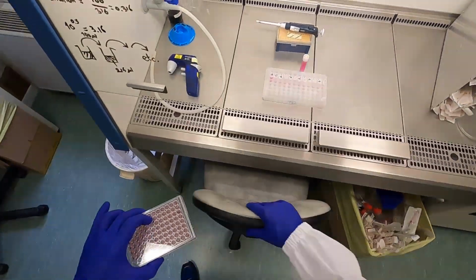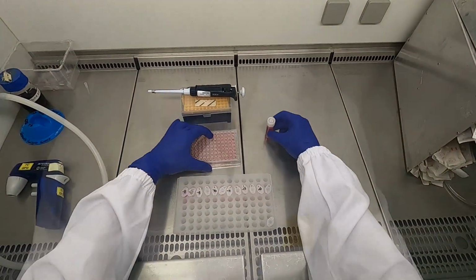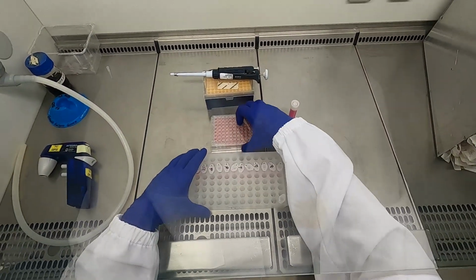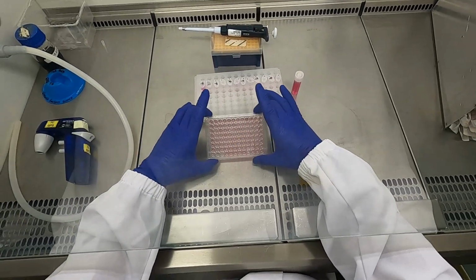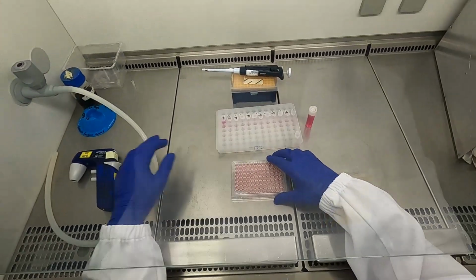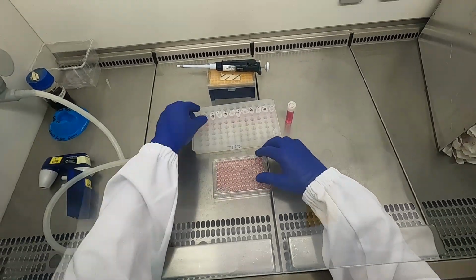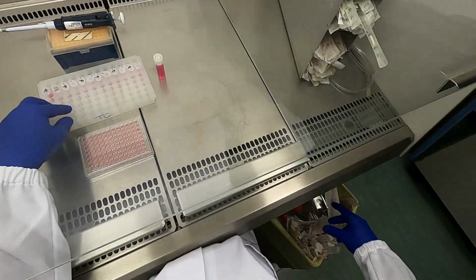Okay, organize a little bit your working space. Everyone has its own sort of layout or setup. Make sure you have your space so you don't have to go over the plate with your sleeves or hands or tubes or anything. Just organize it a little bit. We have our row of dilutions.